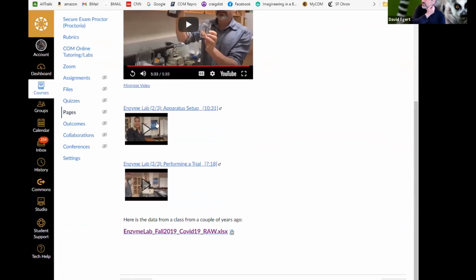So the setup. This one's going to take 10 minutes. We've got time. Again, I think it's important for you to have a sense of how we actually do this, because part of this lab is about learning the mechanics of how you practically do this and what the gotchas are that you have to worry about. Here Tina is going to show how to set up that whole system with the little vessel where you can do the reaction, capture the bubbles, and measure them.